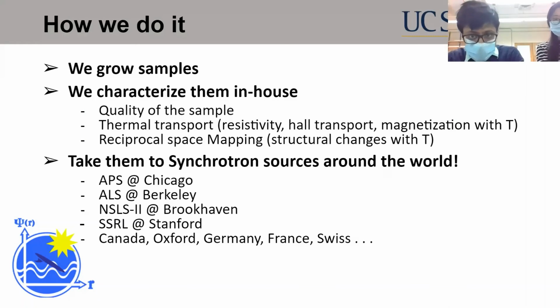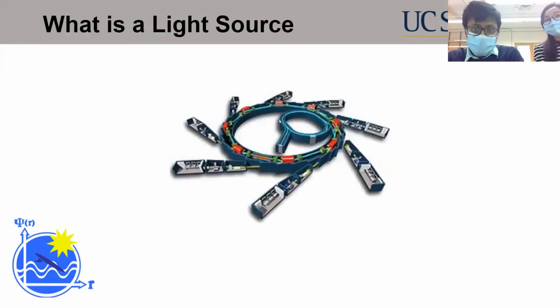What is a synchrotron? A synchrotron is an X-ray source which is extremely tuned to do some kinds of experiments. So here there is an electron source. The electron goes into a storage ring, stays there for some time. Then it's flown into another bigger storage ring where these red things are. What are those red things?